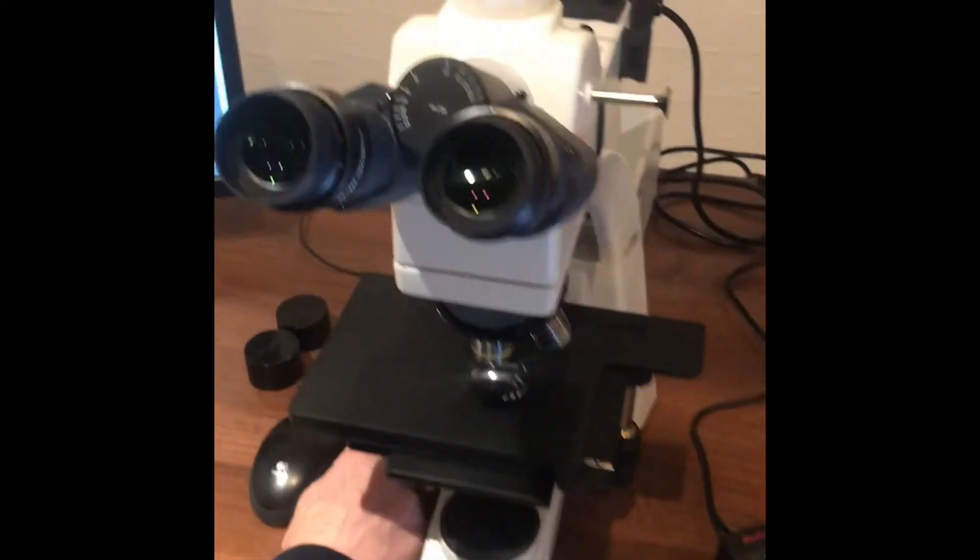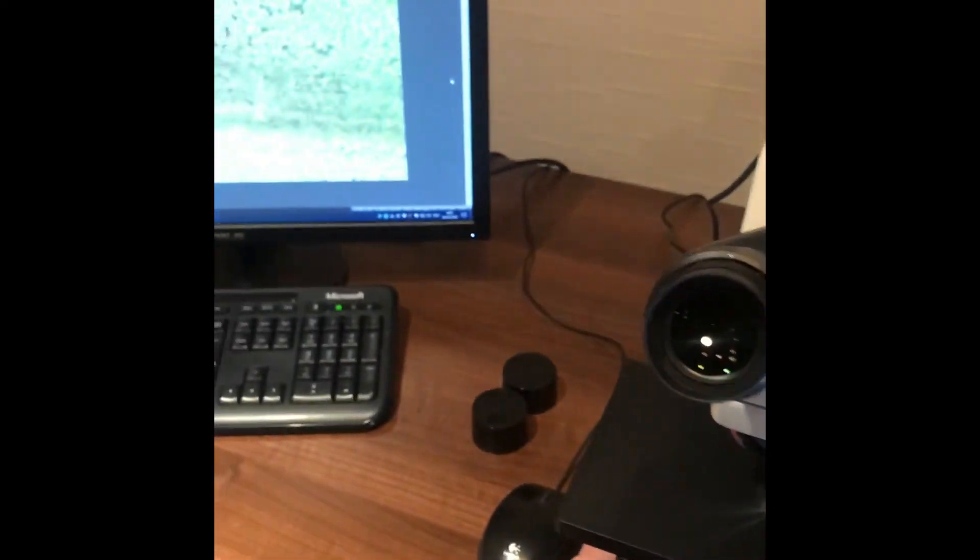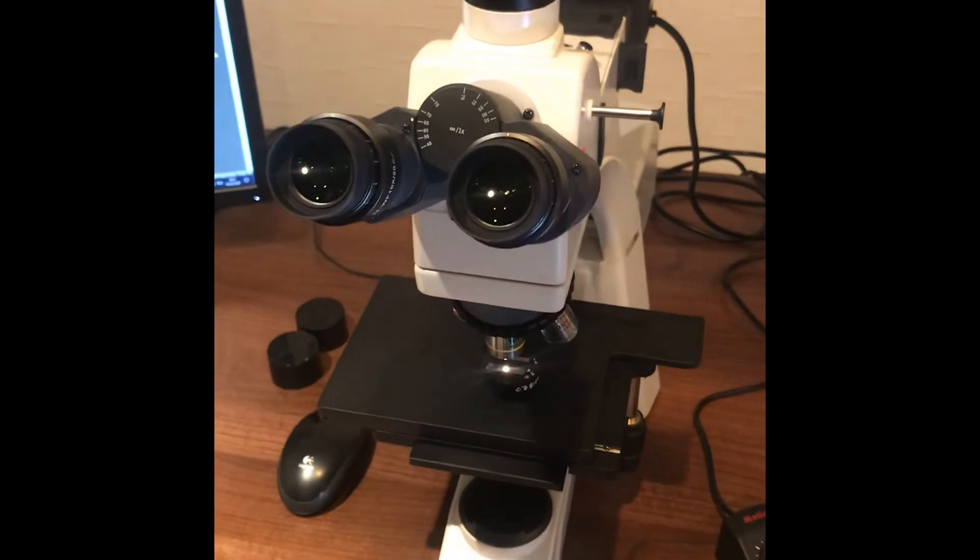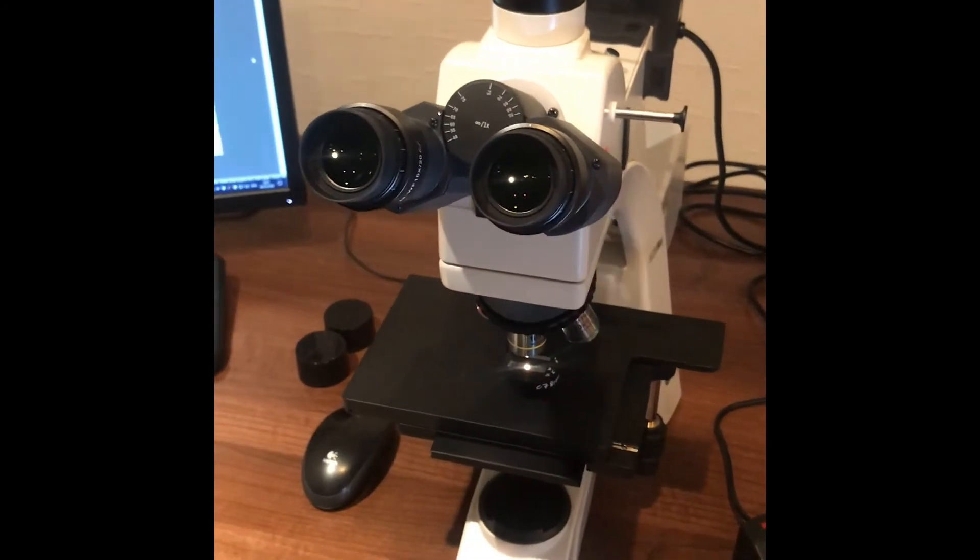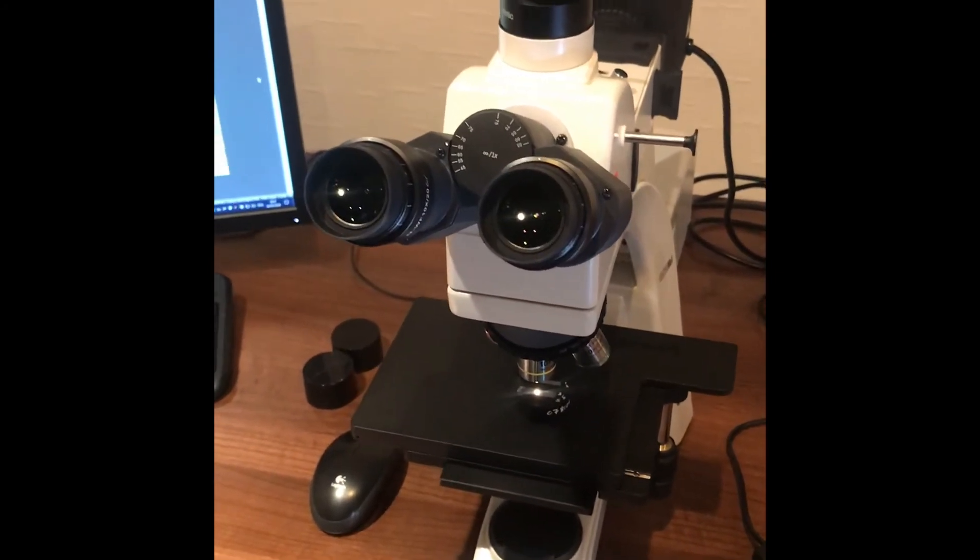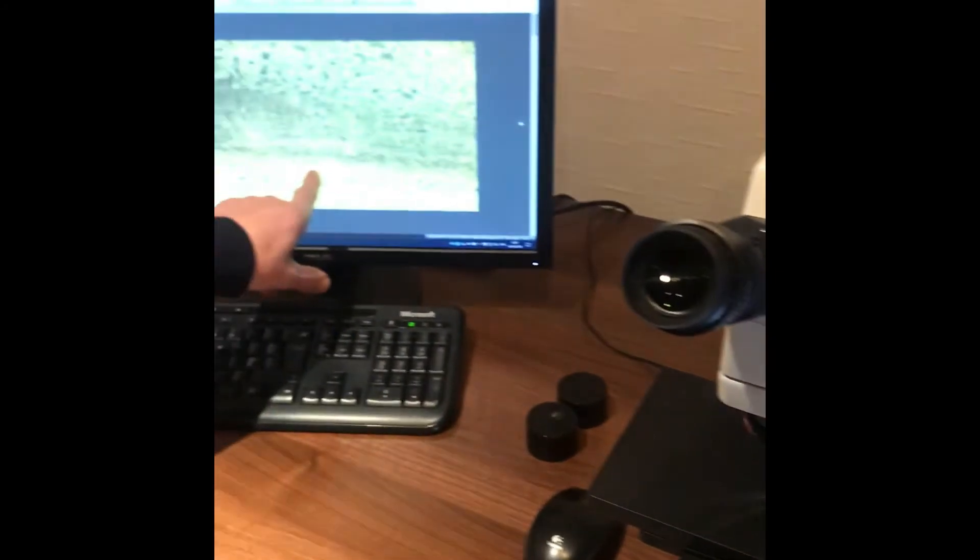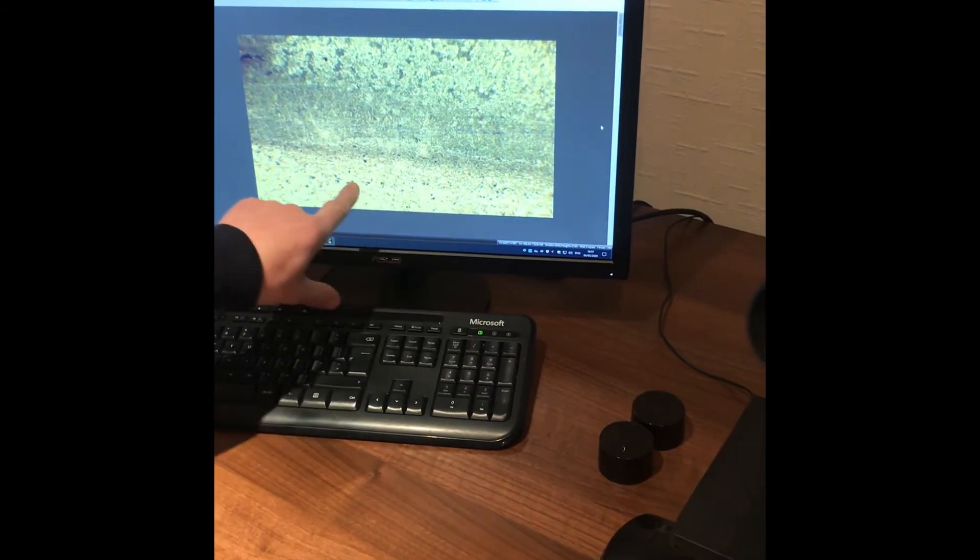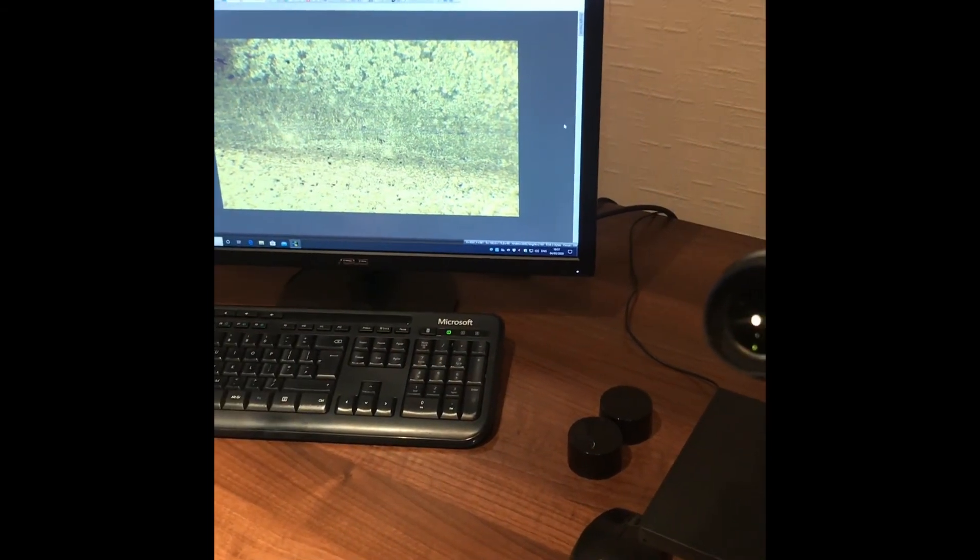We've got a compound microscope which we're now set up at a hundred times magnification. So this is good for metallurgy. So we're able to see the grain structure of the material and the heat affected zone.